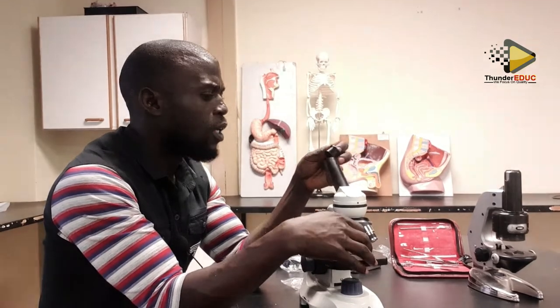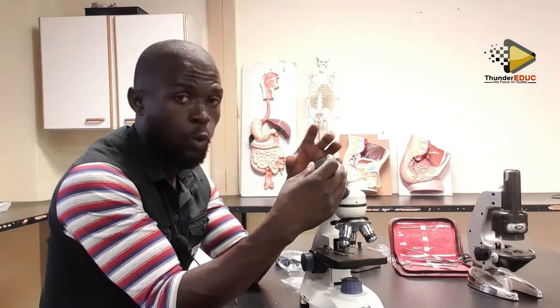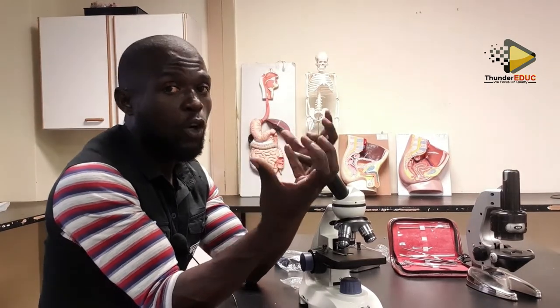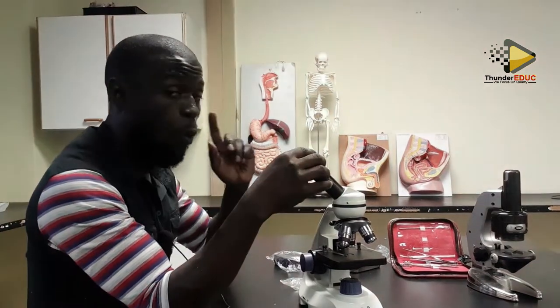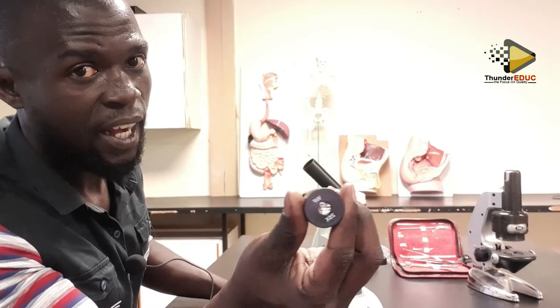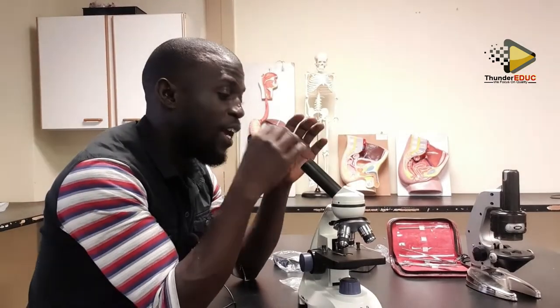Some of them have two eyepieces. If there are two, then we call it binocular. It means that you see using two eyes. However, if it has one eye, like this, then it is called monocular. It means that you are viewing using one eyepiece. I close one eye and use one eye. But if I have two of them here, and I use both like this, then it's called binocular. However, they give you the same function.